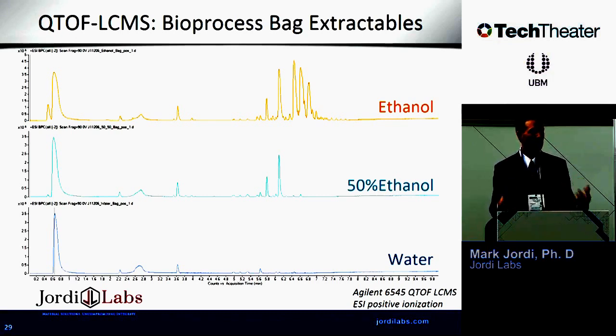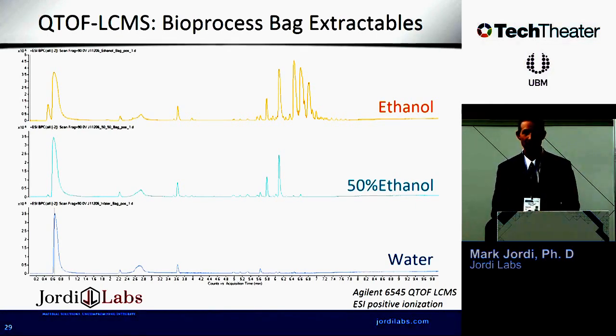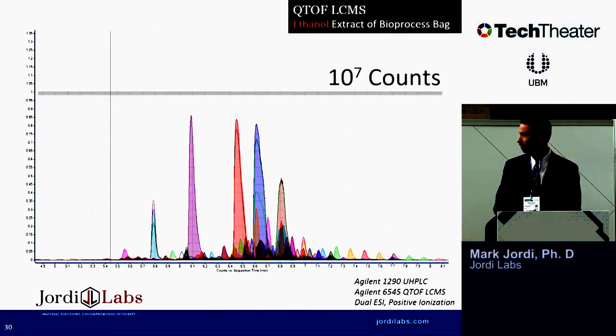Now, when you start looking at GCMS and LCMS data, many laboratories will typically go through this, and it's effectively a manual process or a semi-automated process in which they will click on each of these peaks to identify what components are present. In our laboratory, we don't use that process. I want to take you through a little bit of what we do use, if we could advance.